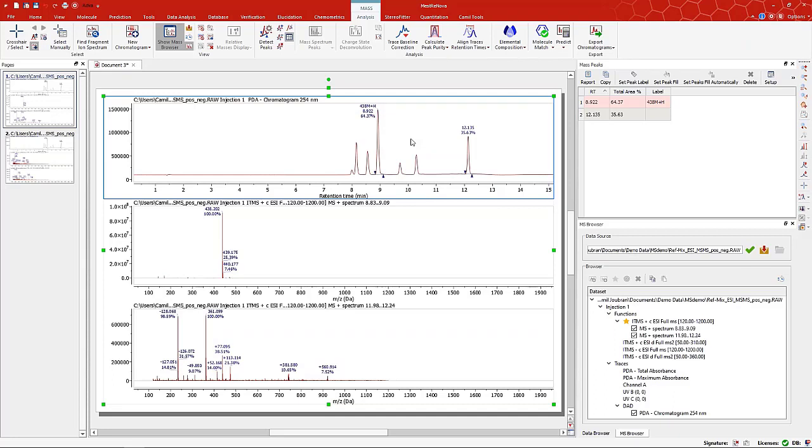Usually in an OpenLynx report or something, you'd see something like that. And for the other one, I could do the same thing, and I'm going to put the 361.10. You can see it's added to the top there, right?